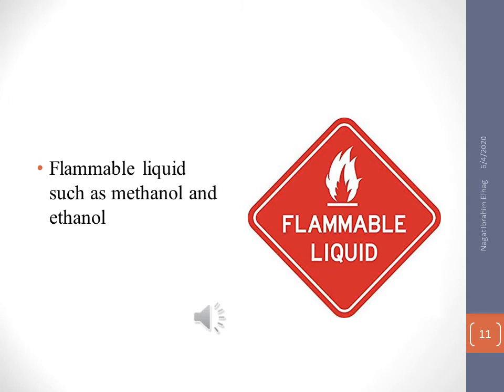One of these reagents is methanol and also ethanol. They are flammable, so you have to be careful when you are handling these reagents, and you have to read and know the whole safety data sheet, all the points, to avoid any risk that results from those reagents.